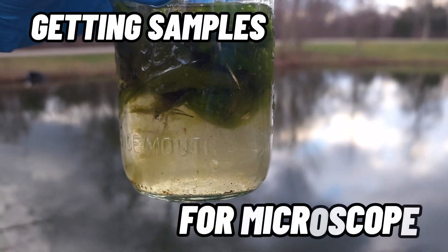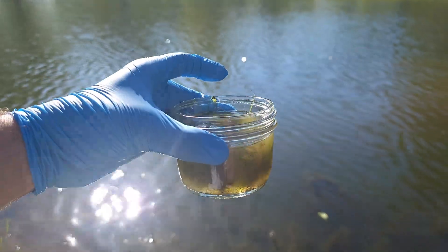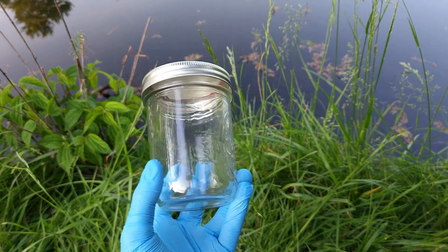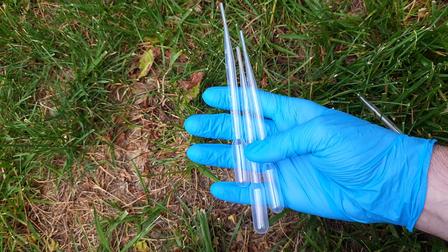In this video I'm going to show you how I get my water samples so that you can as well if you're interested. First you need to get some sort of container that will hold water, and I like to use mason jars for this, but any kind of container with a seal will do just fine.